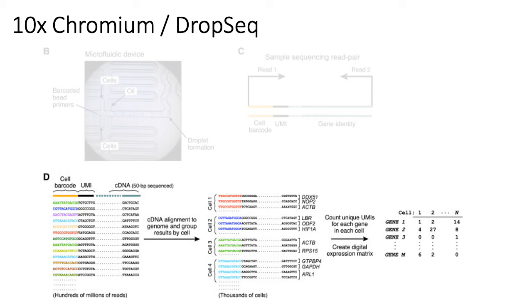And so part D illustrates a hypothetical library that corresponds to a whole bunch of cDNA sequenced from a given single-cell RNA-seq experiment. The important point to note here is that this is an example of the hypothetical library that you might generate, say, before PCR amplification.